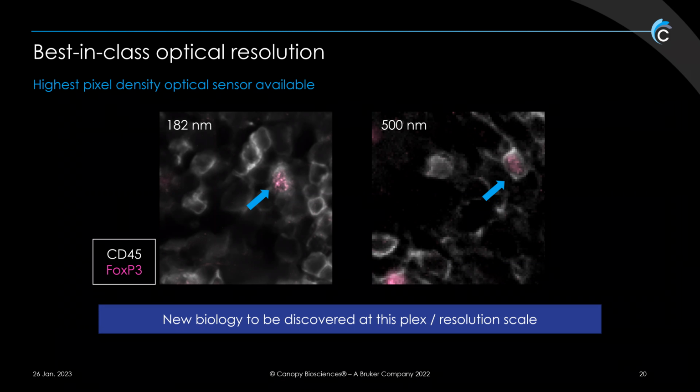On the other, we can actually count those puncta and quantify not just based on the intensity of the overall signal, but rather the distribution and the number of those individual puncta. So that in itself could be really powerful. I think this is a very good use case that's easy to see and really illustrates all the additional data that we're going to be able to get out of this higher accuracy, I guess, or acuity optical train.